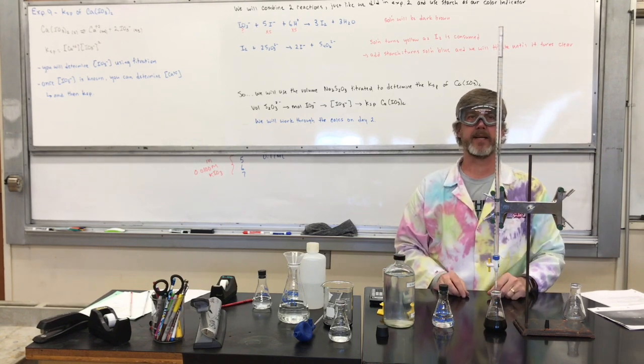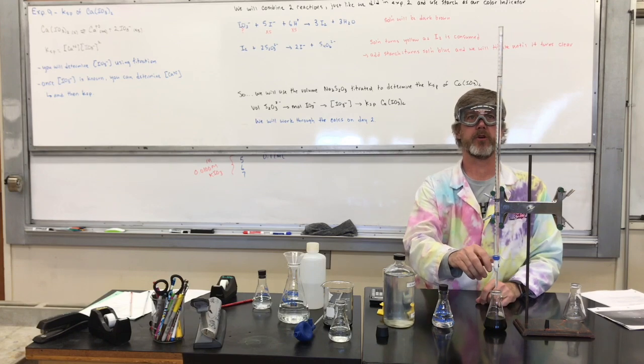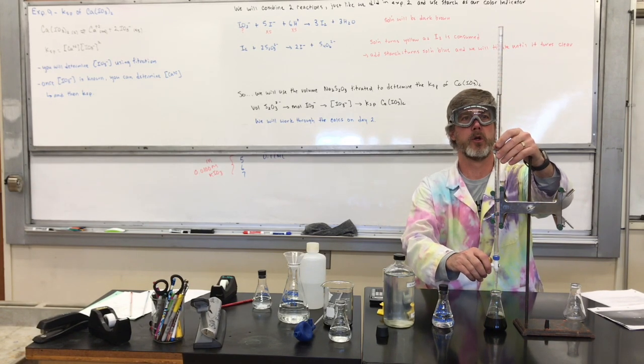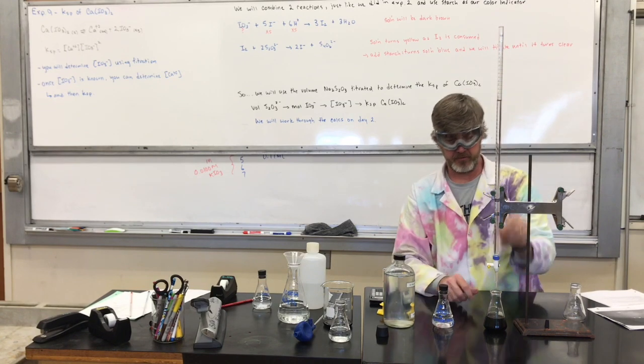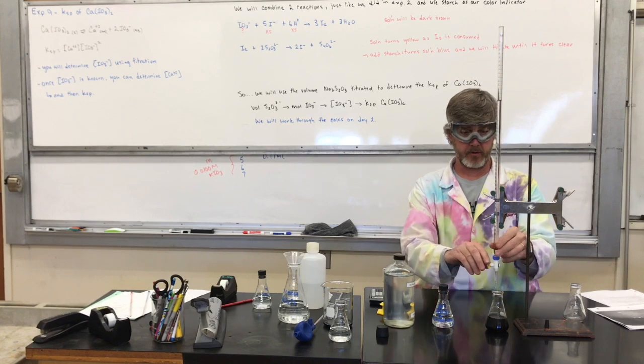So I'm expecting it'll be more than about the 15 mils that it took for the first 3 trials with pure DI water. So I'm going pretty fast for that first 15 mils. Now I need to slow down a little bit.